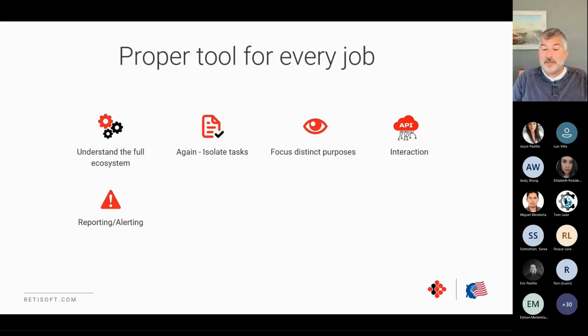It allows dashboarding, real-time reporting, as well as anomaly detection and other aspects of what is deviating from the norm within this space, because that's part of dashboarding: something sticks out. When you see real-time data going by, an anomaly will stick out. It can also dynamically find those and alert on them.